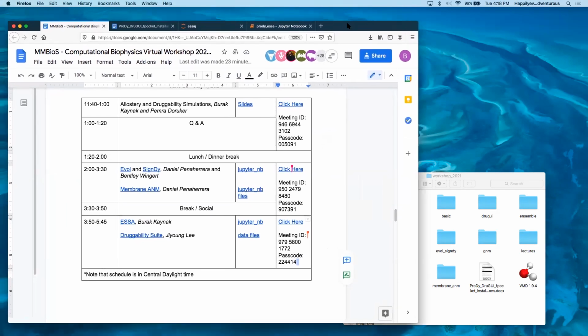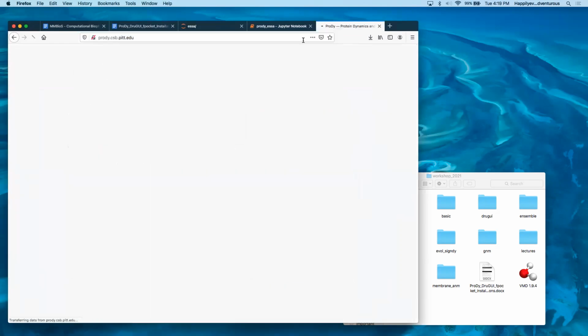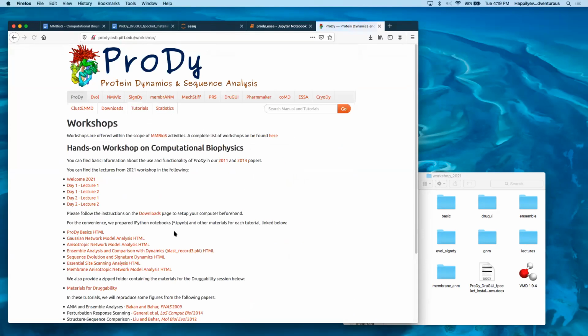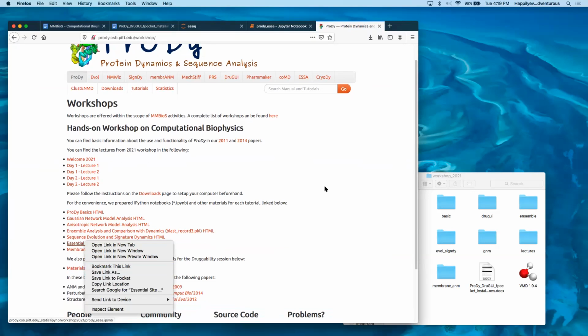Yes. Okay, good. So either you can download the notebook file from here, or you can go to the Prody website and click the link here, and then you will end up with this workshops website, and you can download it here. You can just save link as, and download it.